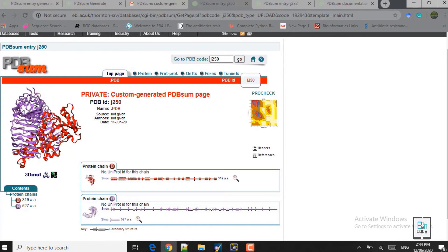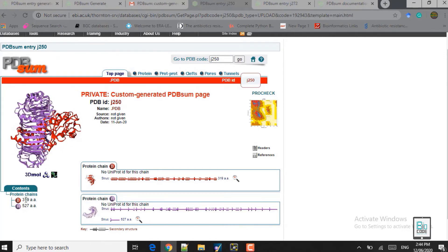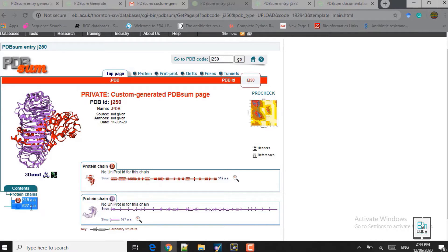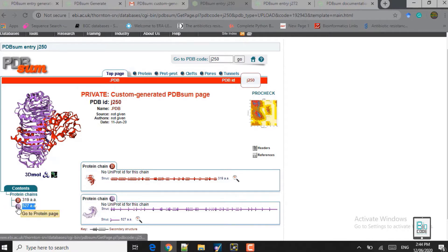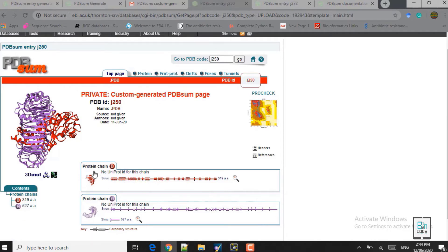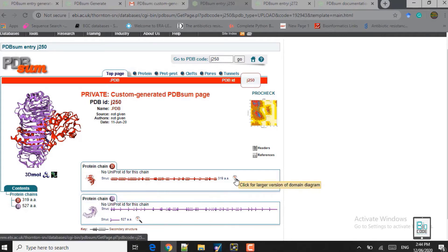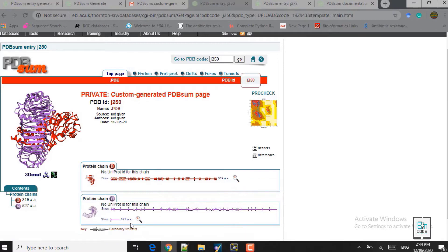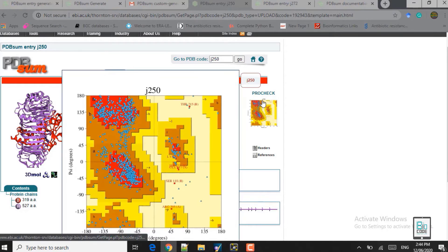In this purple color you can see the receptor, the Toll-like receptor, and in red you can see the ligand protein — the vaccine protein. We have two chains: the first chain is the ligand, chain B, with 319 amino acids, and the second is the 527 amino acid receptor chain, the Toll-like receptor, denoted as chain A. If you click on the magnifying glass, you will see the domain and other details of both the receptor and the ligand protein.